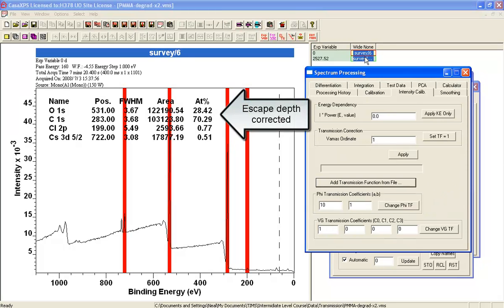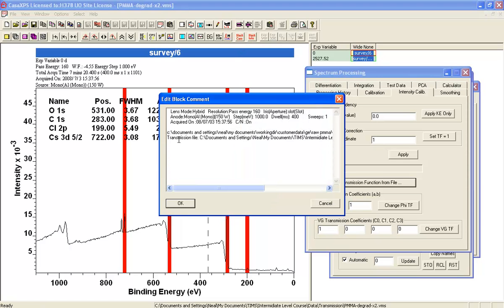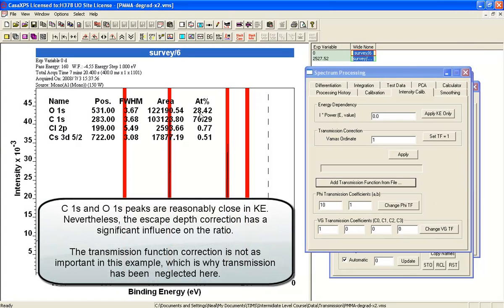When I say open, what happens is both of these are updated. You can see this in the VAMAS block comment where the transmission function file is specified.